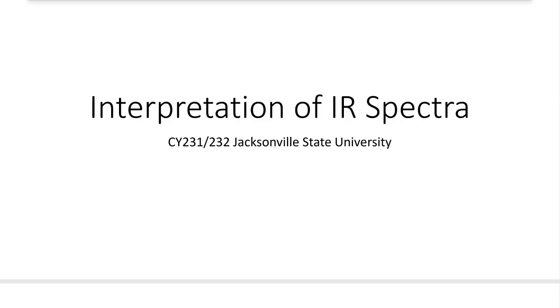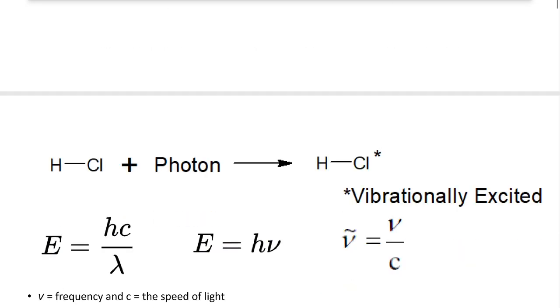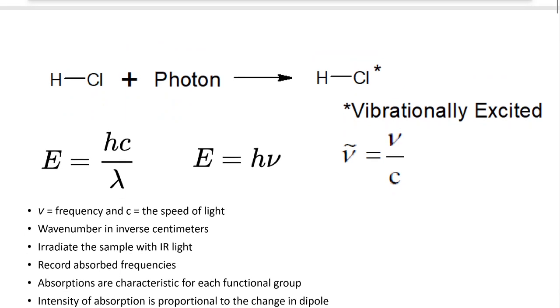Hello and welcome back. Today we'll be discussing how to interpret infrared spectra, specifically how different peaks determine which functional groups are present in a molecule. So first, a little background information.